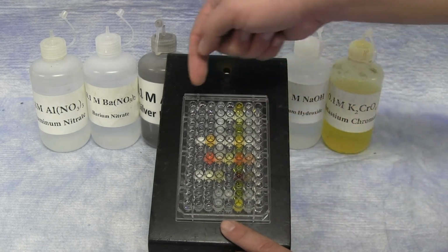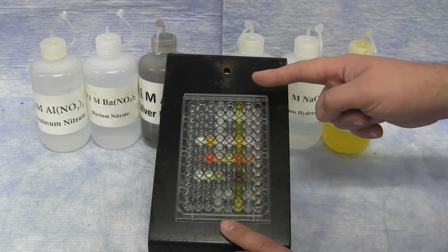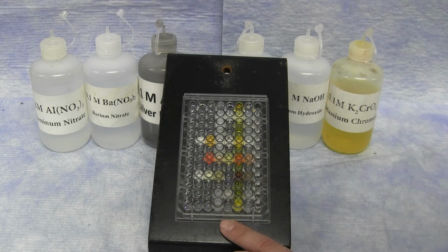In the lab report, you're going to be comparing across the rows and periods and up and down the columns on the periodic table and looking to see which metal ions precipitate with more components, and that would be a more reactive material. You'll also be comparing an unknown. For reacting the unknown, you'll use it just like one of the other metal nitrate salts.